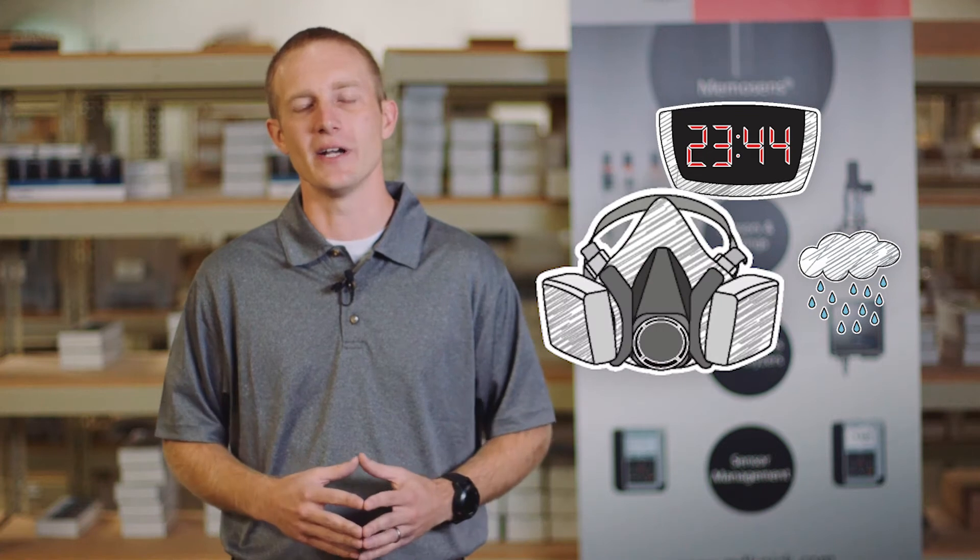The primary benefit of using MemoSense digital sensors with a portable meter is that the calibration data is stored within the sensor head and not in the transmitter. This allows us to perform an offline calibration in an environment and at a time that's convenient to the operator — no more calibrating pH sensors in bad weather, at inopportune times, or in hazardous areas.